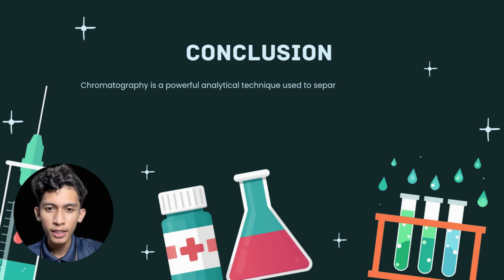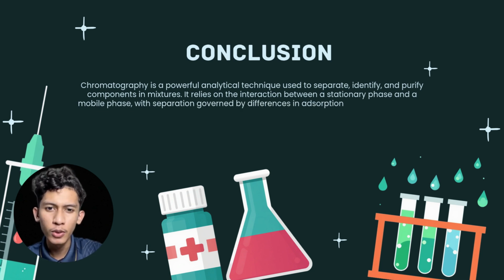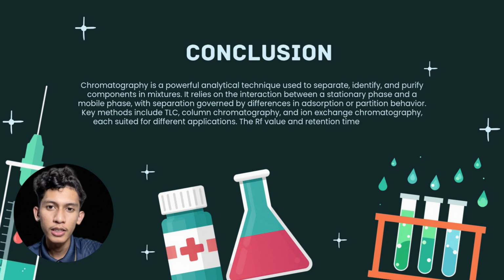In conclusion, chromatography is far more than just a standard laboratory exercise. It is an indispensable analytical tool, providing precise physical fingerprints like RF values and retention times. It gives scientists the power to verify substance identities with absolute certainty. From hospital diagnostics to environmental protection and quality control, it ensures safety and consistency on a global scale.